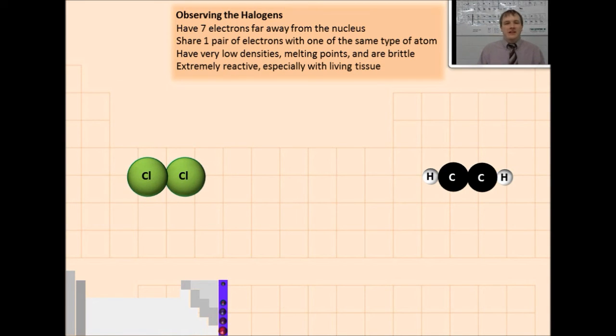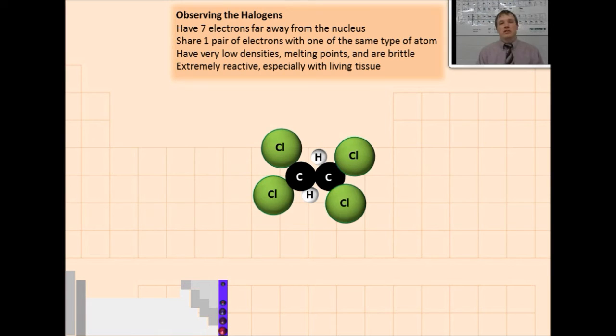And it will react. In fact, 2 chlorine molecules are going to react with each acetylene molecule, and we make a substance known as tetrachloroethane. Now, this tetrachloroethane is just going to remain in the water in the graduated cylinder at the end of the lab. It's not anything that participates in the reaction at all. It's just the product at the end.